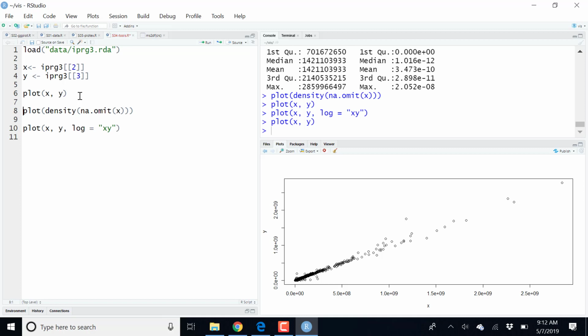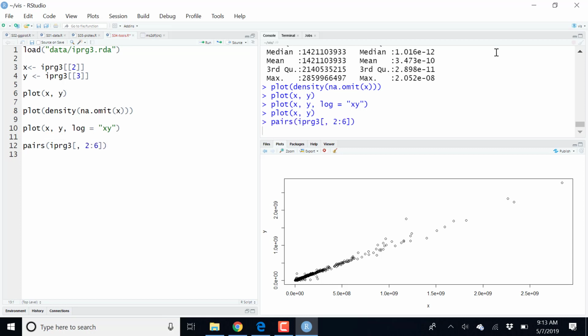And actually, many of the normalization methods that are used, maybe not that much in proteomics, but in other high-throughput data sets, systematically convert the data on the log scale. So if you want to generalize this practice of doing our scatter plots, for example, here I'm going to use only a subset of our data.